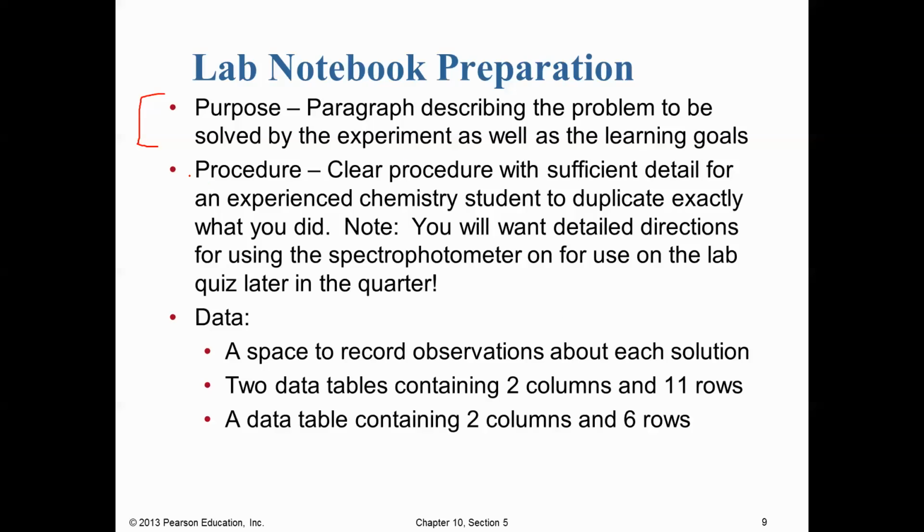All right, so another thing you're going to need in your lab notebook after the purpose, you're going to want to include a procedure. And so the procedure you want to make sure is quite clear and quite detailed. And you might even want to sketch some things you see in the pictures in the procedure for this particular lab. The reason for that is there's going to be a lab quiz later in the quarter. In that lab quiz, the only thing you're going to be allowed to use as a resource is going to be your lab notebook. And so you want to make sure you have really good procedures in there, because that's going to help you on that lab quiz later in the quarter.